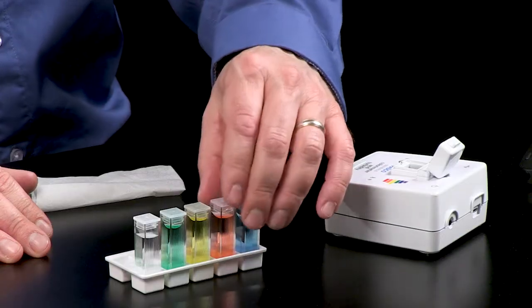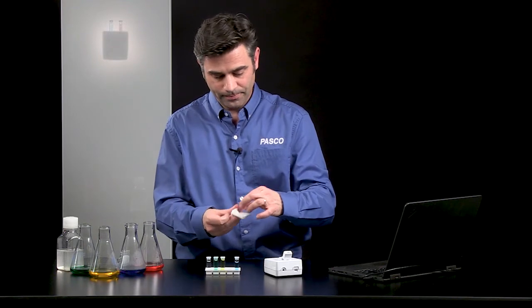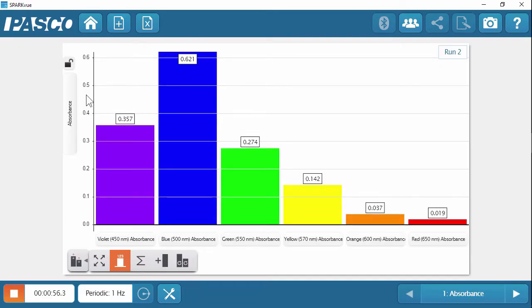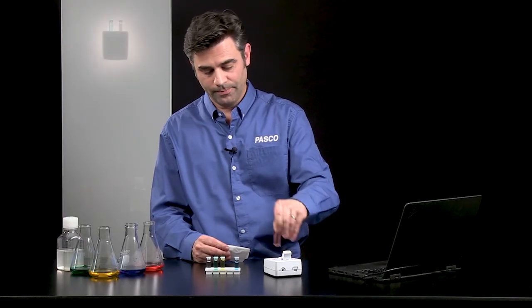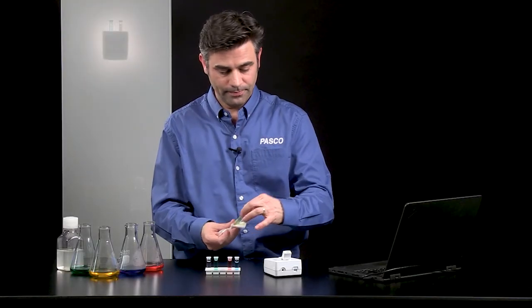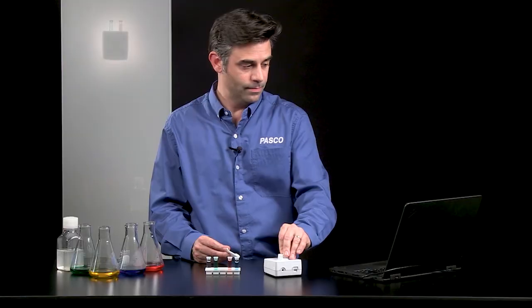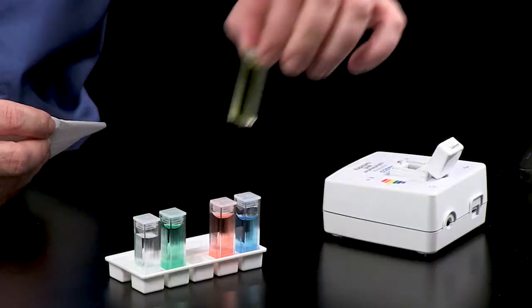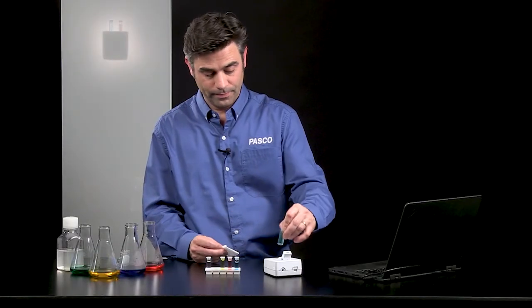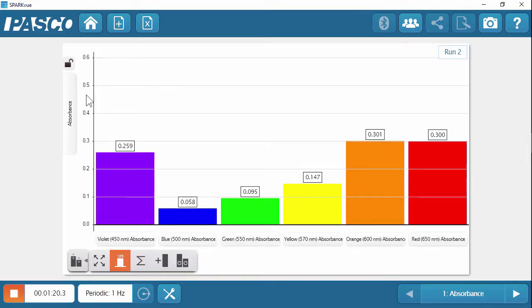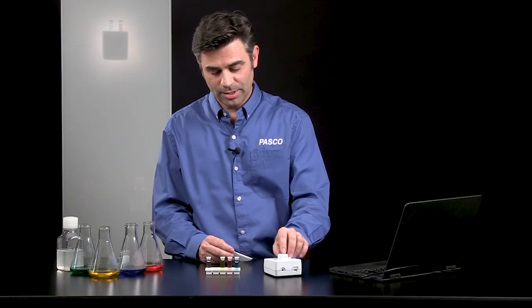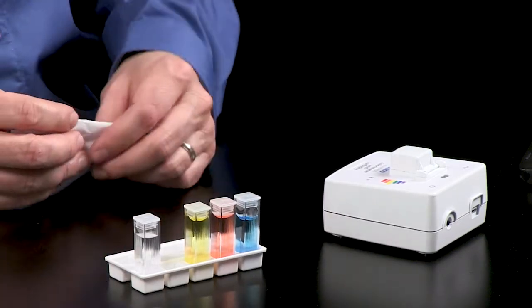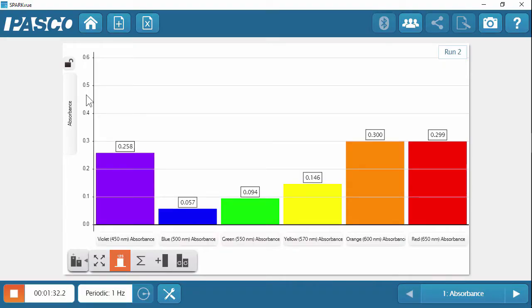And we can look at that if we compare a couple other samples. If I pop in a red solution, we'll see that's absorbing mostly the other end of the spectrum, the blues and greens. If I put in a yellow solution, that's absorbing mostly violet. Again, thinking about that color wheel. And finally, if I put in a green solution, this one's interesting because it's absorbing lots of oranges and reds and it's absorbing lots of violet. And that's because that green solution is a mixture of blue and yellow. So I'm getting both of those absorbance values in that mixture.